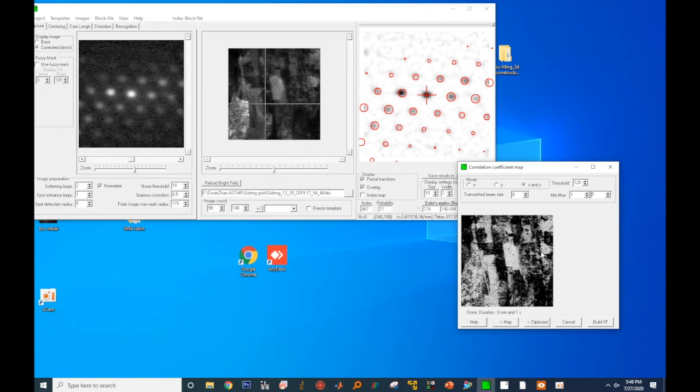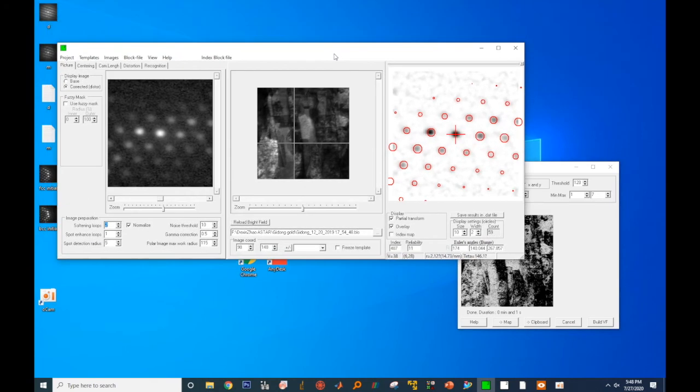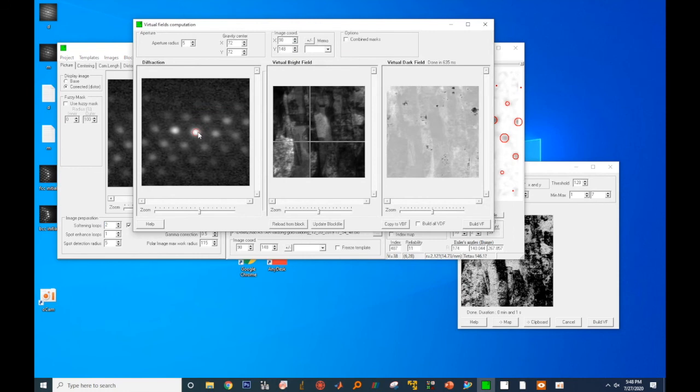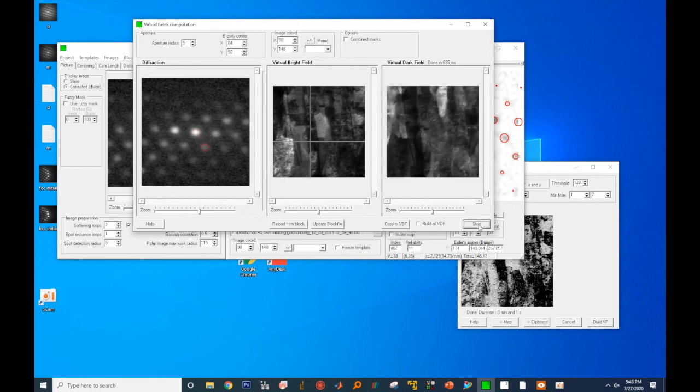In the right condition, these maps can look quite artistic. The last data visualization technique I want to cover here is the virtual dark field imaging. To do that, again, you click on block file and select virtual dark field. You can move the virtual aperture around, then click on build VF to have the virtual dark field image.